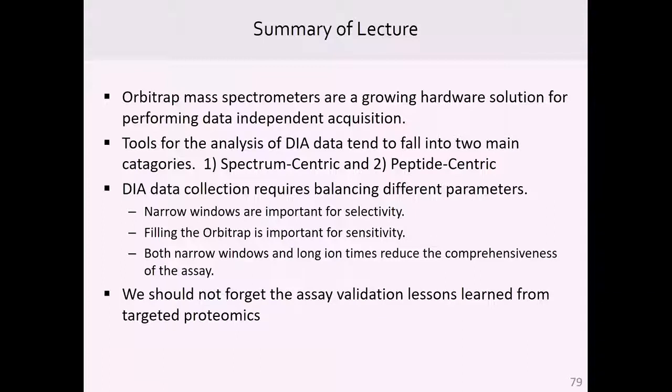Can I just jump in with one comment? What he's going to talk about on Thursday is just one case of what I learned, or realized, at one of these courses: there can be 2 phases, and you can use DDA, you can use DIA, you can do runs separated by 36 hours to look for degradation. You can do a set of runs on pooled sample. You could start with a huge library, which we frequently do, even in the cases that Mike is talking about.